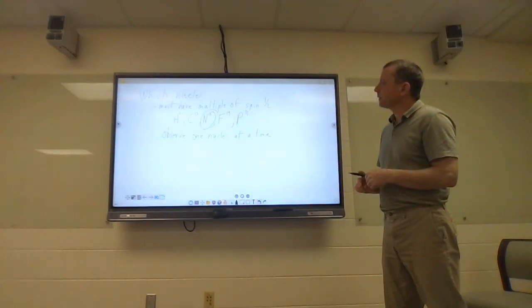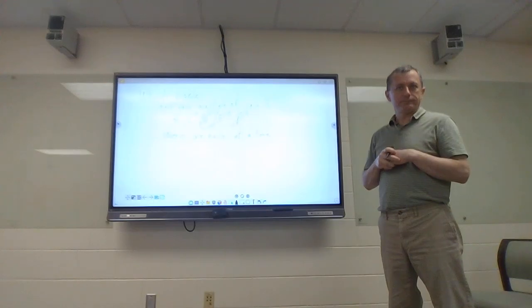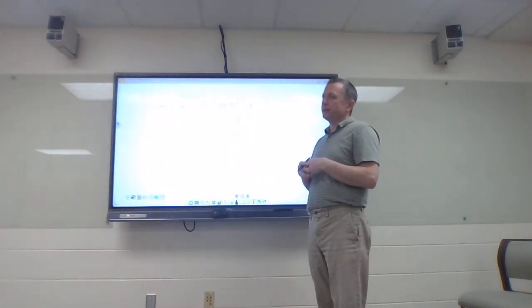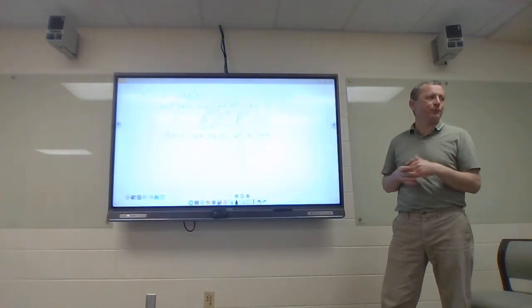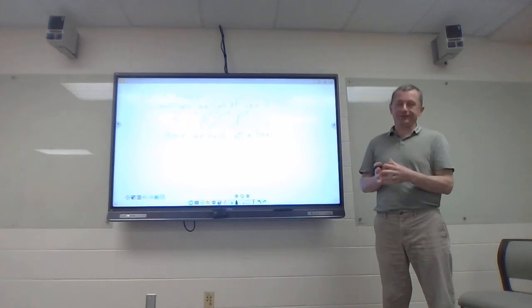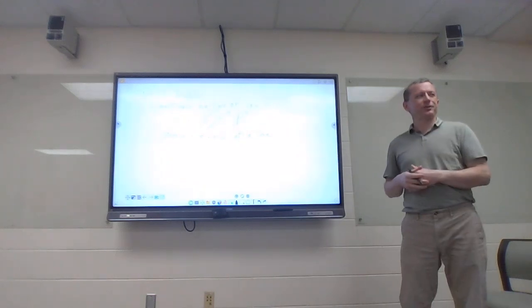All right. For us, we're going to mostly look at proton. Carbon's a lot harder to look at, much weaker. It's really not as informative. I don't learn as much from the carbon as I do from the proton. Having said that, the ACS standardized test likes to throw on carbon spectra that really doesn't help you much. You can probably get the structure.